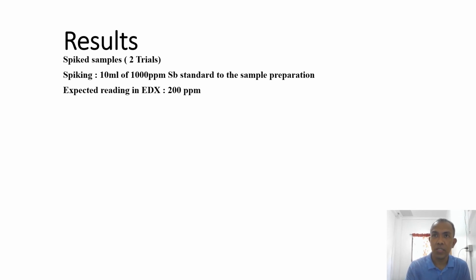So tinaasan ko na talaga kasi para also in this reading nga pala, as for information din. Parang this is also sort of a learning for the Shimadzu staff kasi this is their first time to read this. Kumbaga, study rin sa kanila ito is how, kung gaano kataas yung kaya i-read ng kanilang instrument. Kasi sarili ko itong sample prep, hindi yung usual na sample prep, liquid yung gamit ko. Usually ito sa solid na kanilang ginagawa sample prep. So my expected reading is 200 ppm dapat.